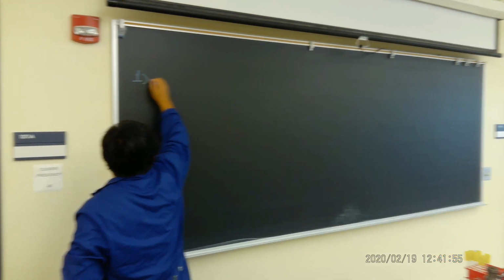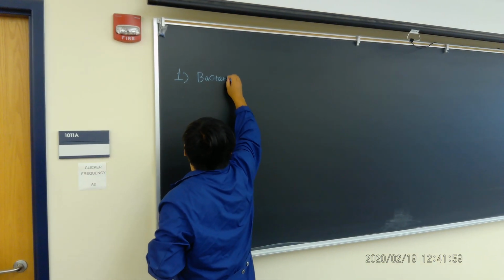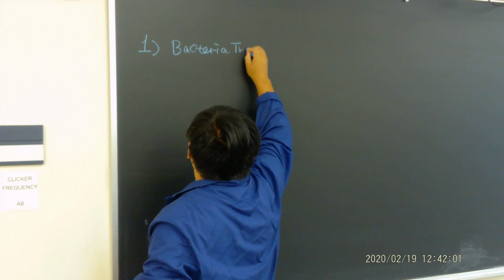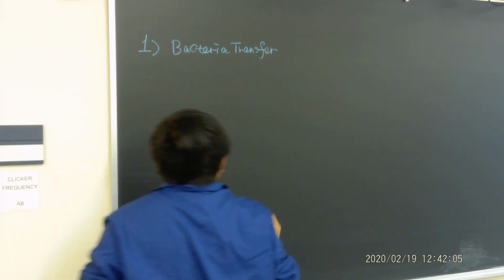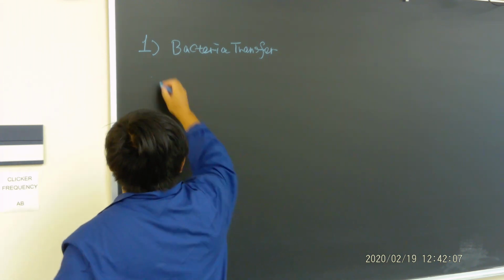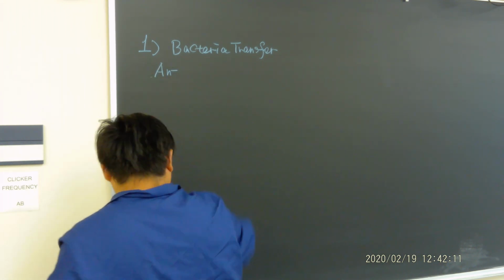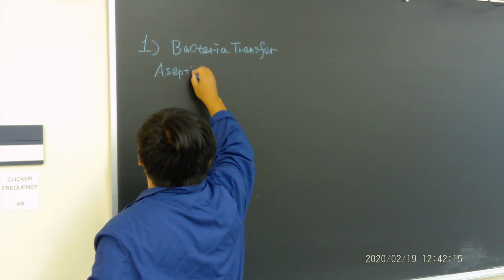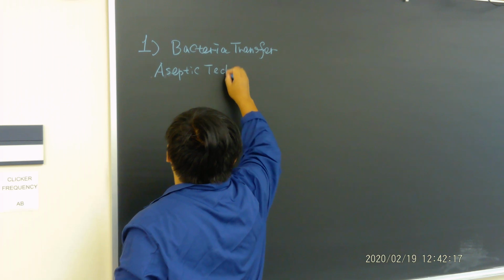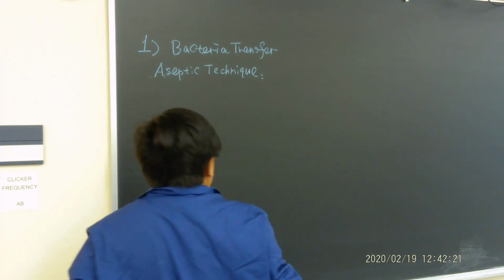First thing, we will do a bacteria transfer. Okay, I'm still going to talk a little bit. Bacterial transfer, we mentioned aseptic technique. So what is aseptic technique?